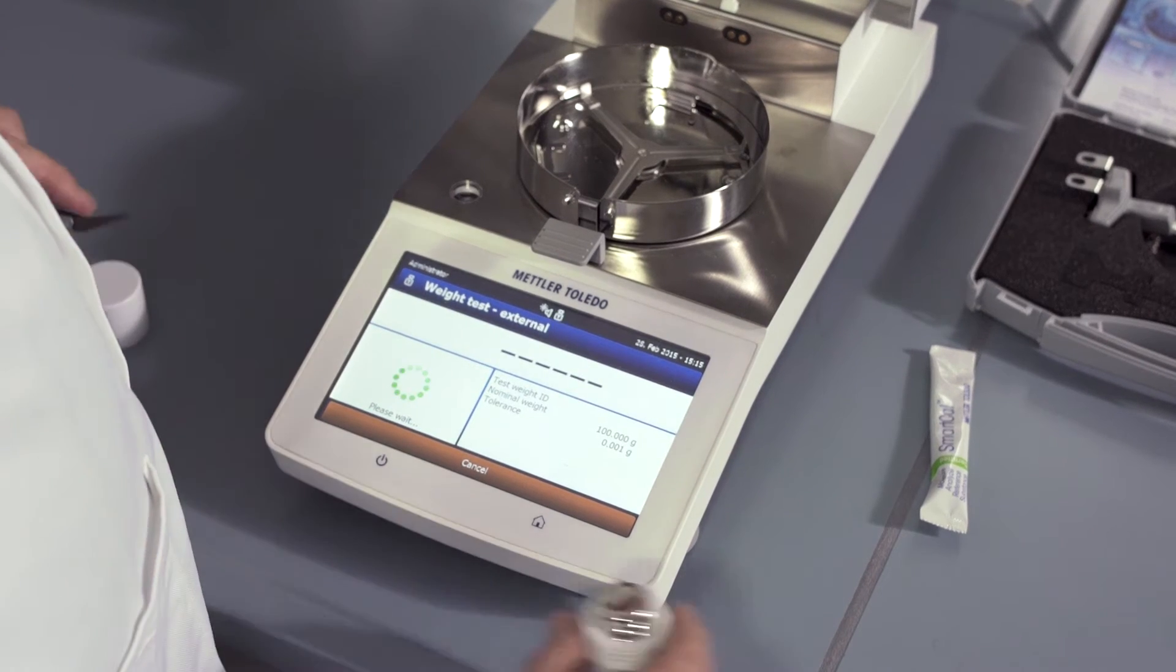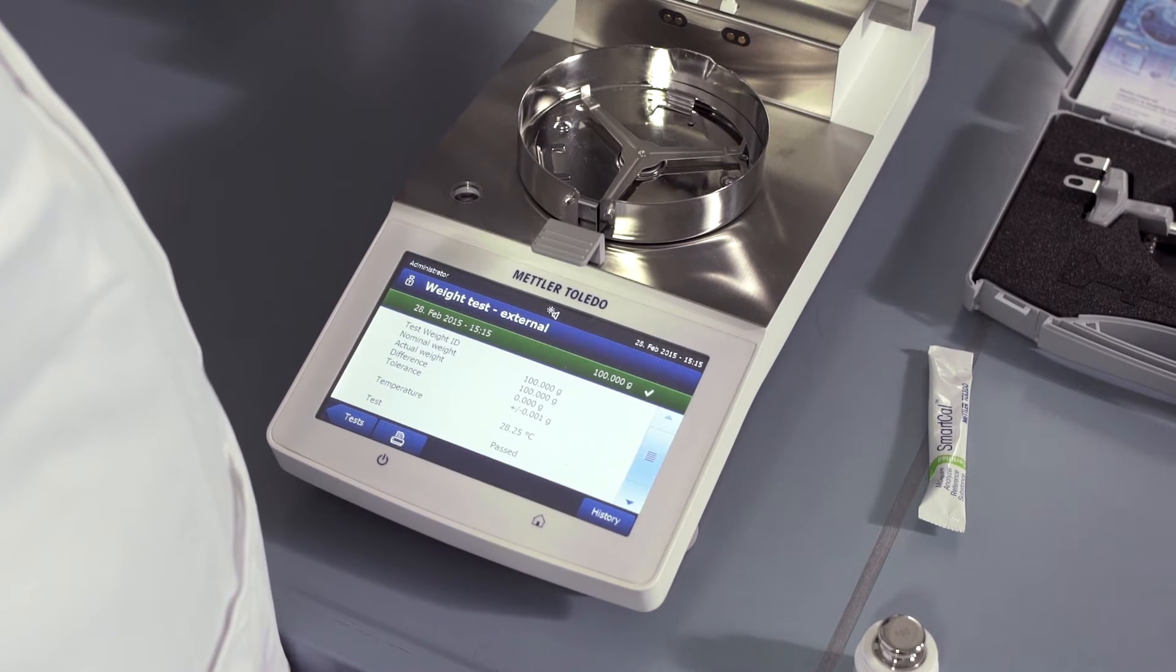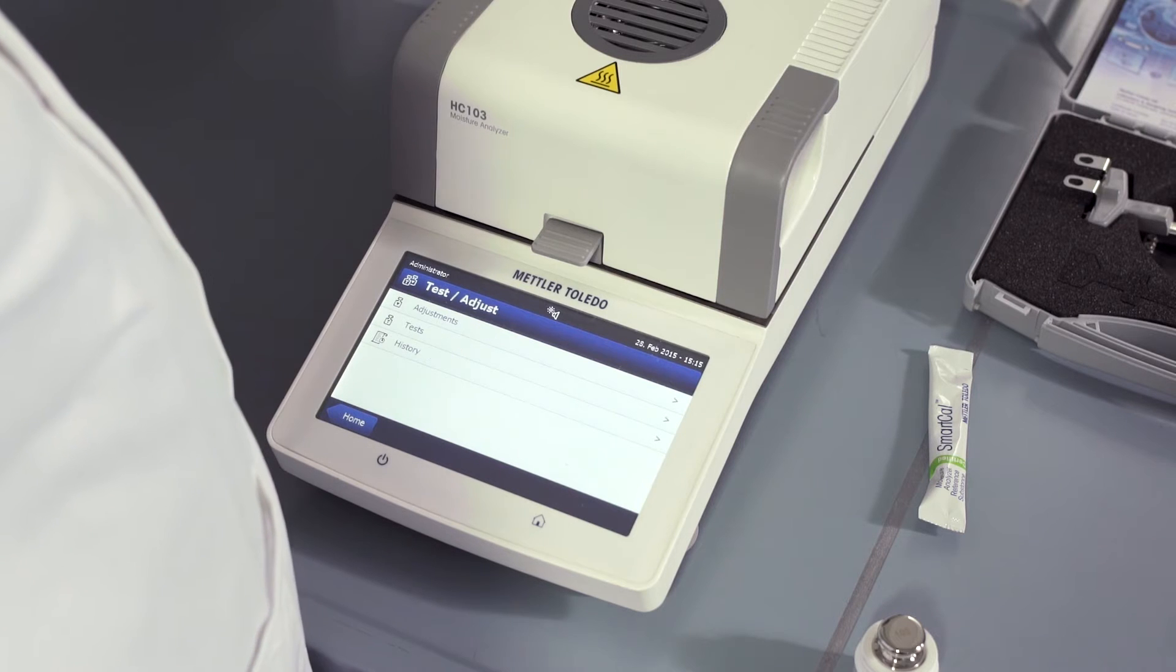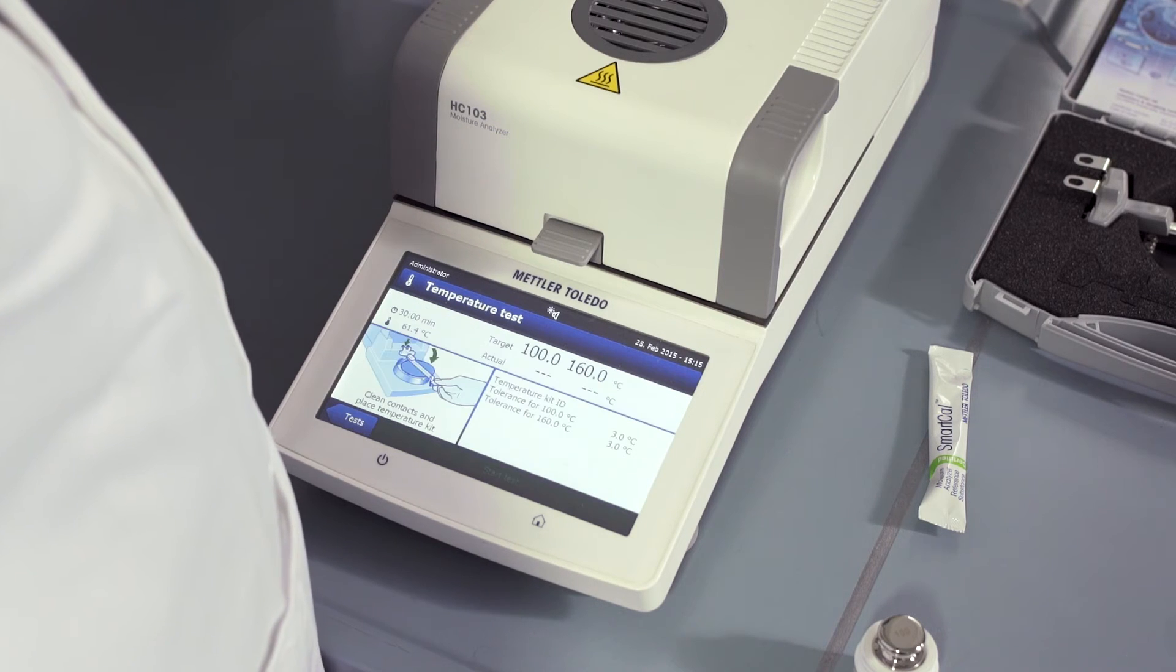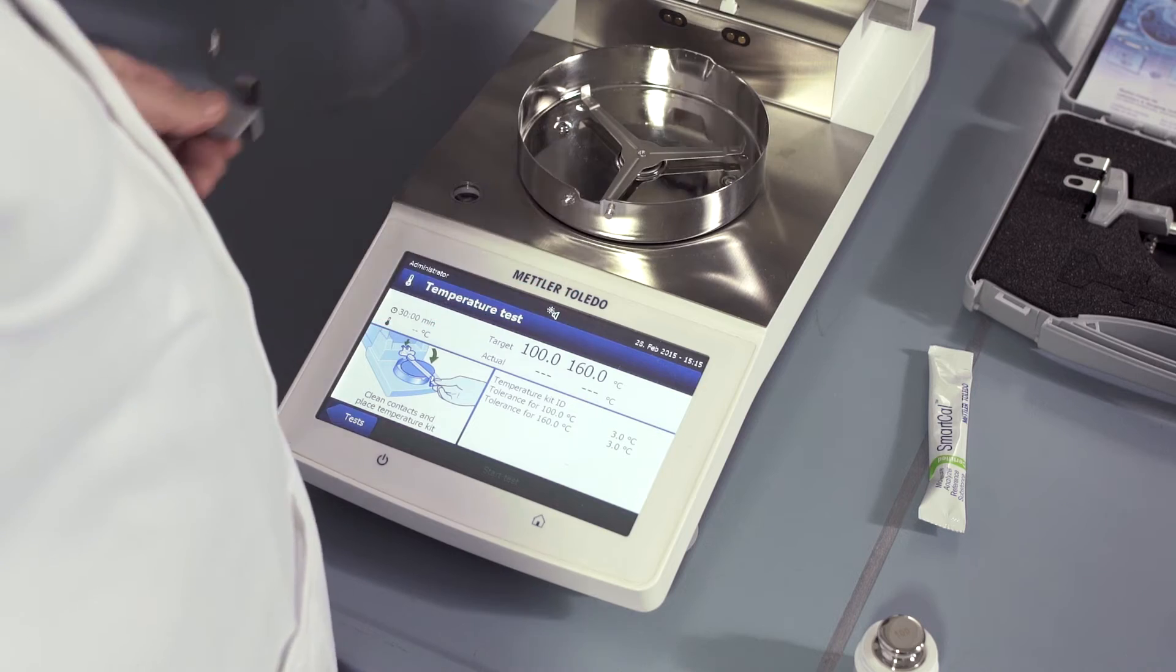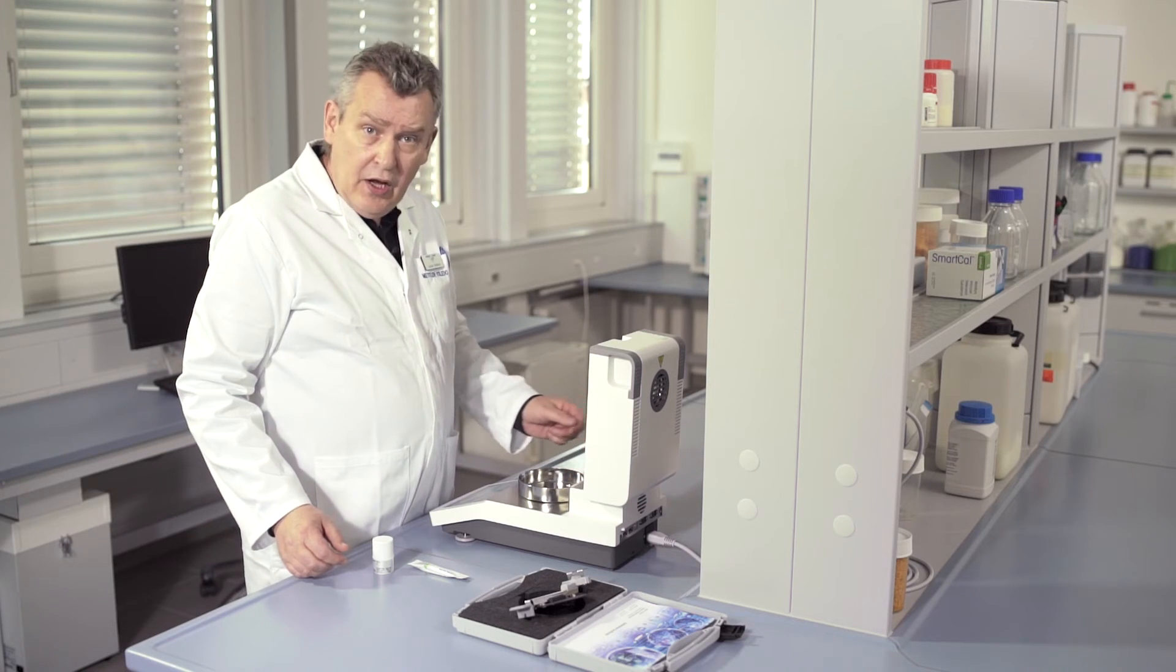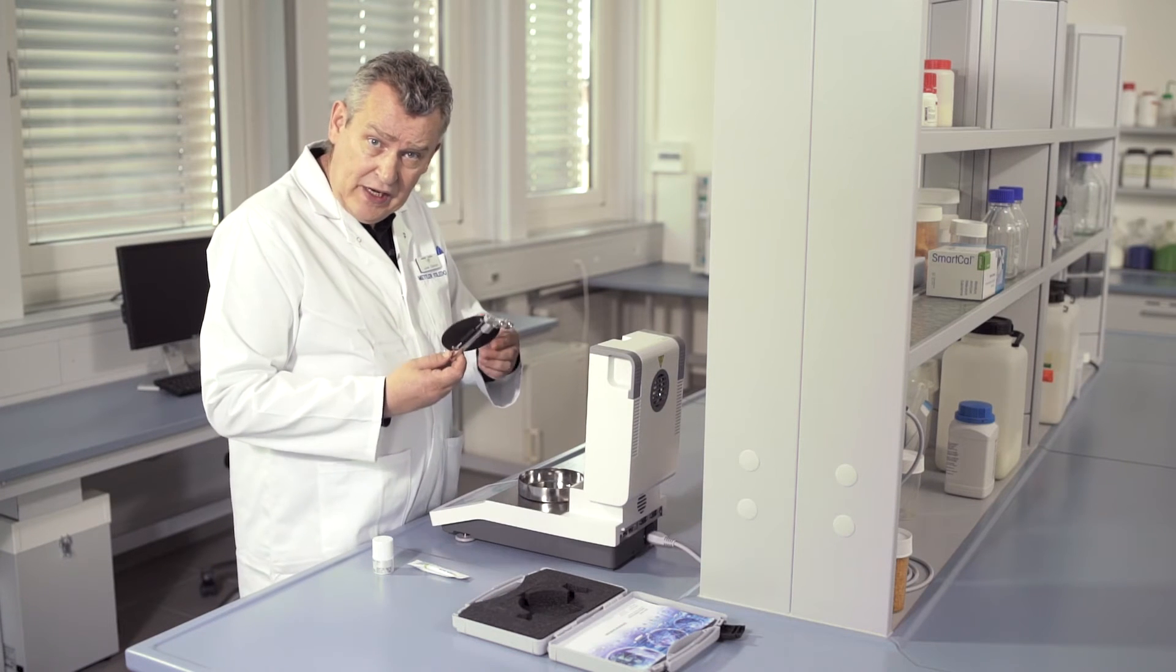To test the heating unit, press the test adjust button and then press tests and select temperature test. Now remove the sample pan handler and the sample pan holder.